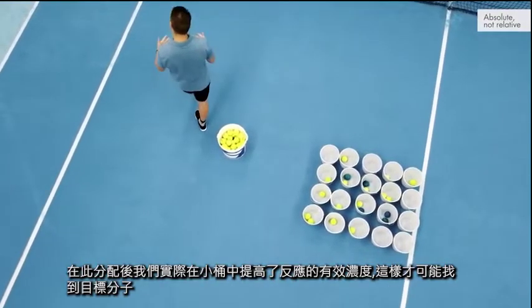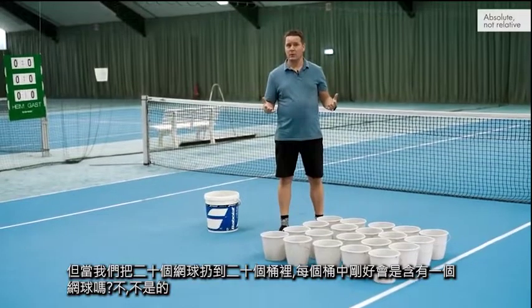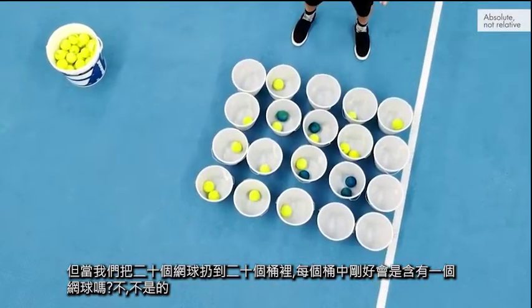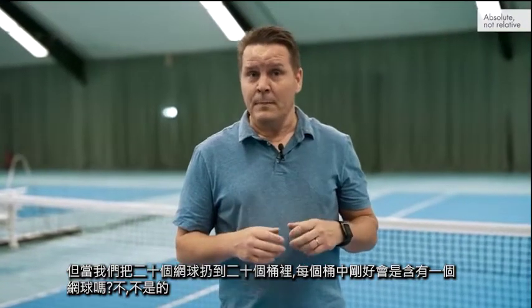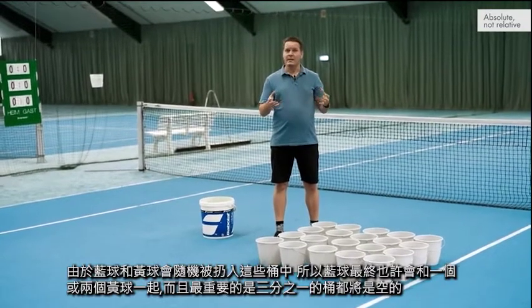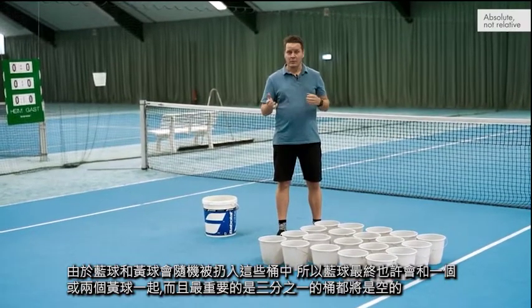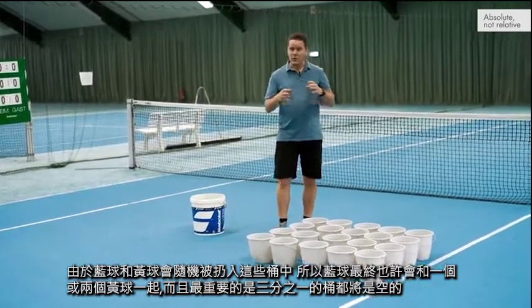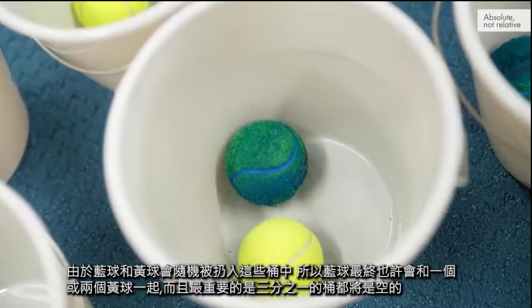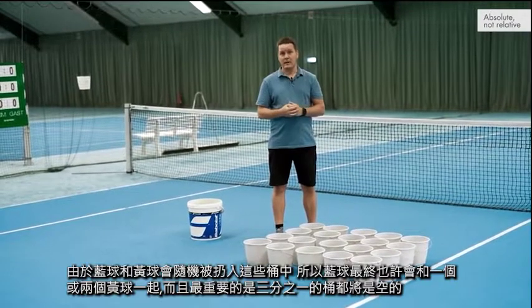So we have thrown 20 tennis balls into 20 buckets. Is every bucket filled with a tennis ball? No, they are not. Because of random distribution, the blue tennis ball and the yellow tennis ball will end up randomly in these partitions, or buckets if you will. And our nanoplates work the same way. So the blue tennis balls are ending up in a bucket, perhaps together with 1 or 2 yellow tennis balls. But most importantly, 1/3 of the buckets will be empty.